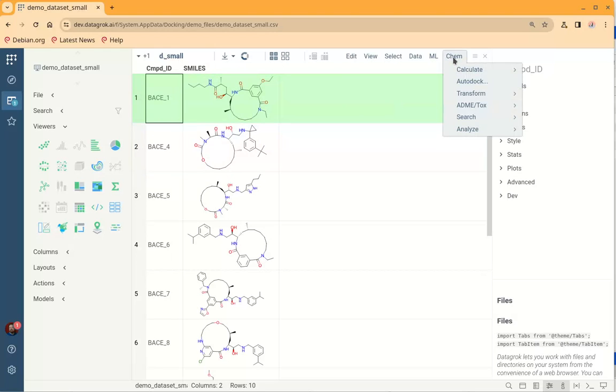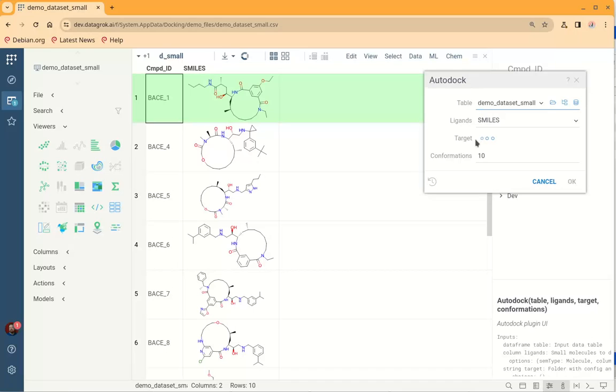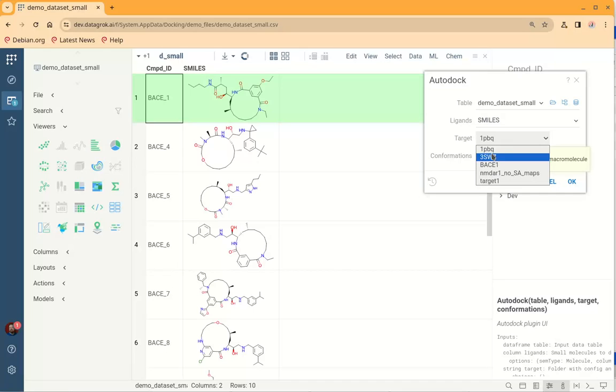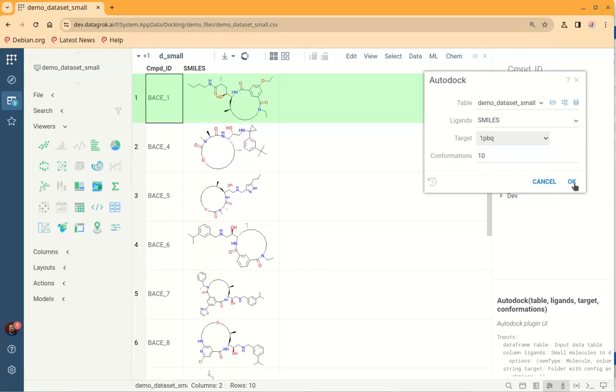To do this we need to navigate to Chem, choose Auto-Dock Plugin, and then the only thing we need to do is choose one of the pre-configured targets and run the calculation.